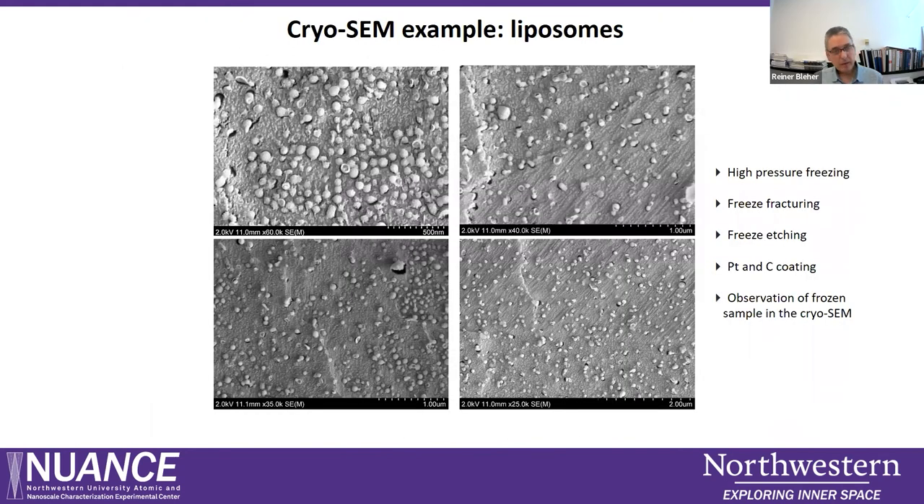Here is an experimental sample of liposomes, also high pressure frozen, fractured, etched, and coated. We can nicely see the individual spheres, and in some cases the fracture blade went through the liposomes so we can look inside them.